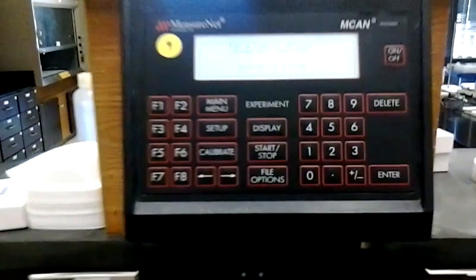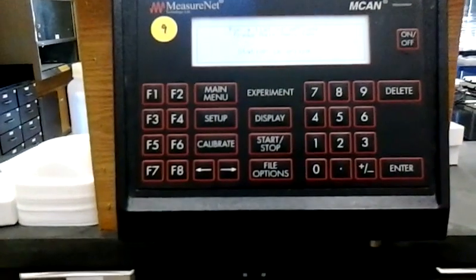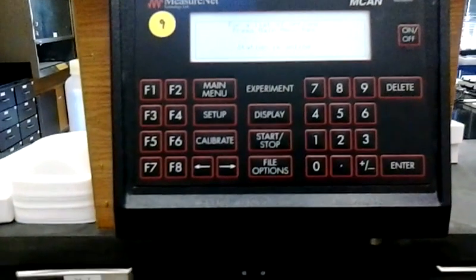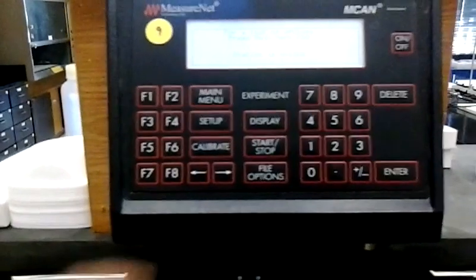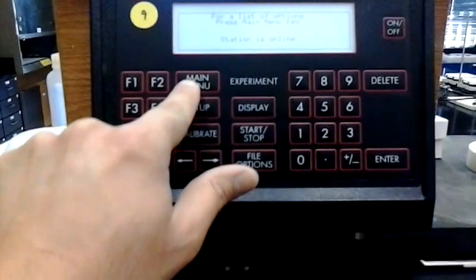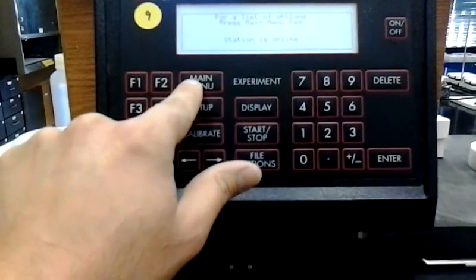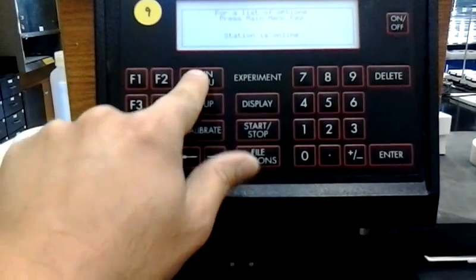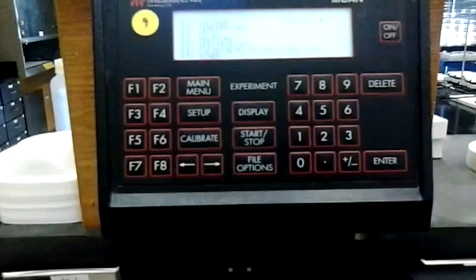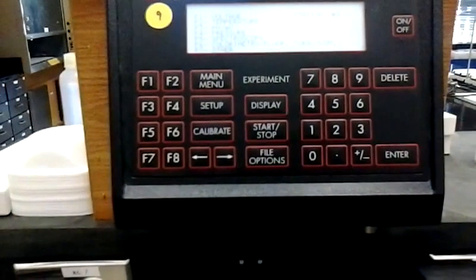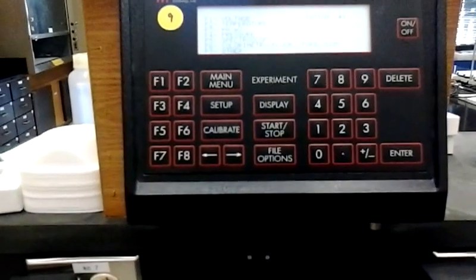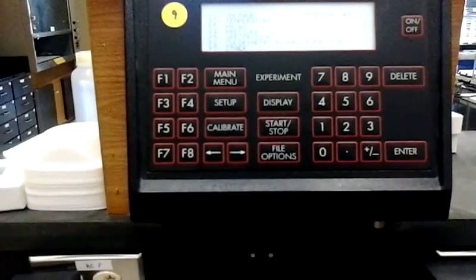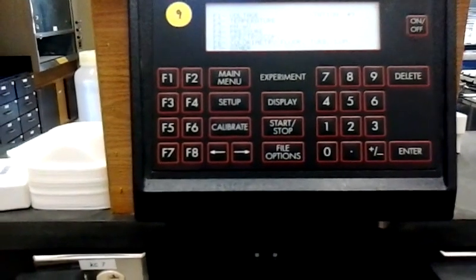Once that has happened, we go up to the main menu of the MeasureNet, and you'll see it'll say station is online, so hit the main menu button here. Now while you have the main menu button pressed, you'll see a list of F1 through F7.